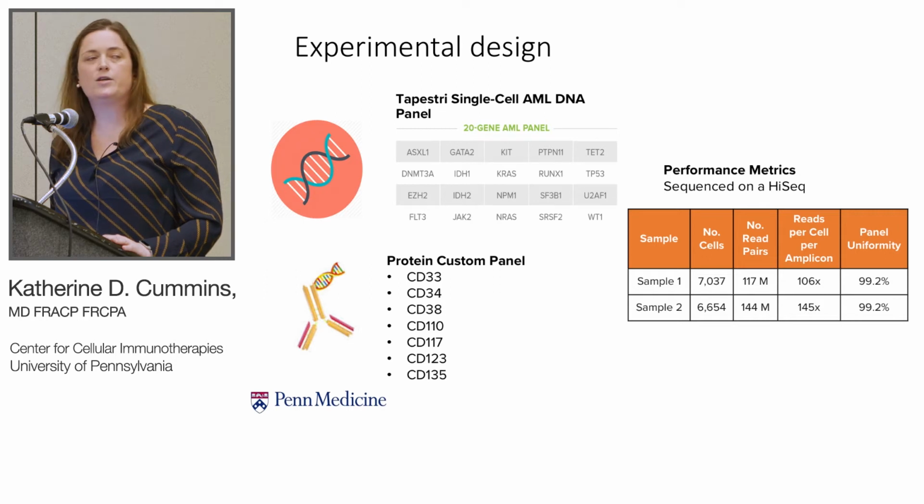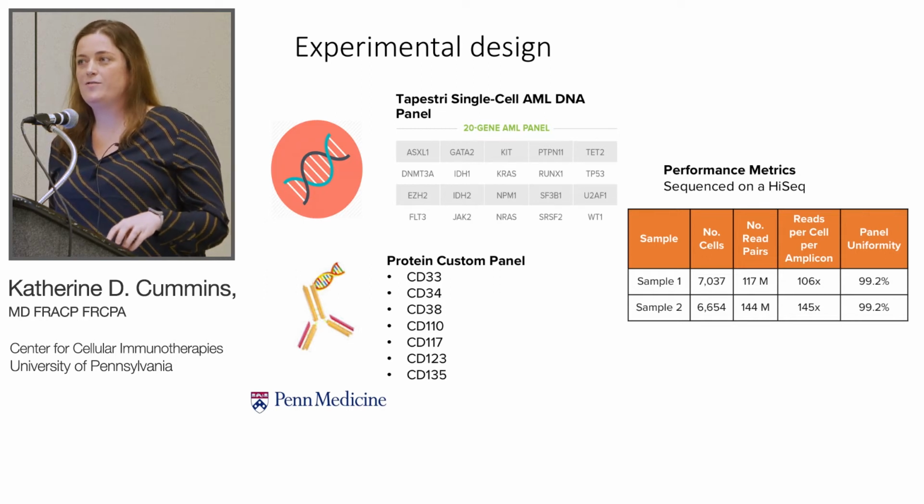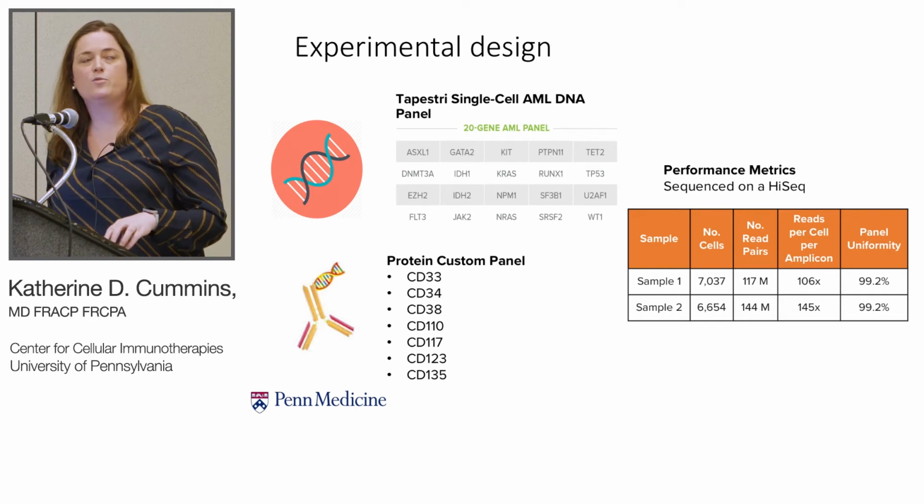It was analysed on a HiSeq, and sample 1 is the 2-cell mixture, sample 2 is the 5-cell mixture, and there was reasonable performance in terms of the number of cells that we were able to successfully analyse, and the read depth is all shown here.